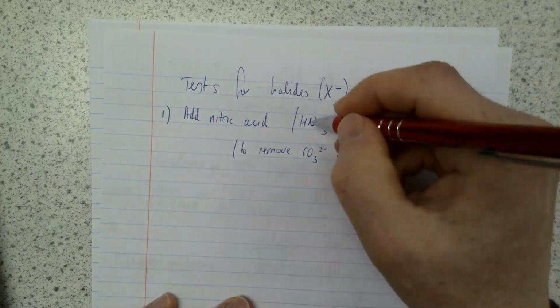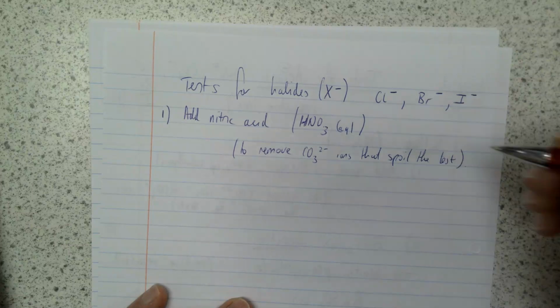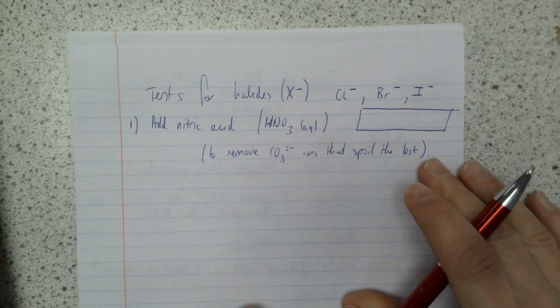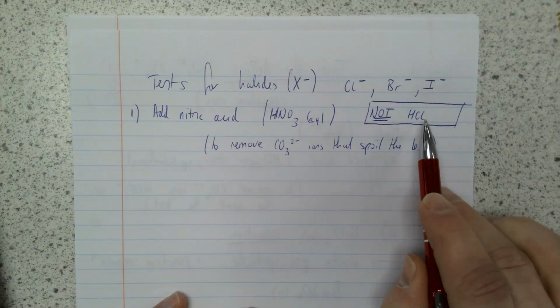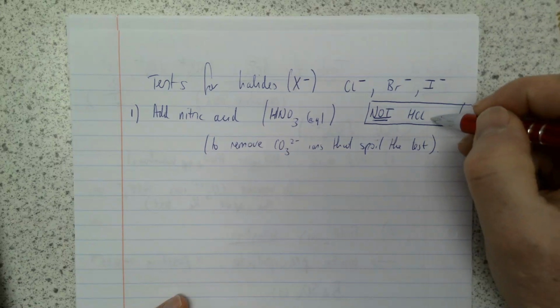It's no good adding hydrochloric acid though, because hydrochloric acid contains chloride ions. That's an important detail, not HCl. If you add hydrochloric acid, you're adding chloride ions to the solution, which means you're going to spoil the test. So you can't use hydrochloric acid for this one.